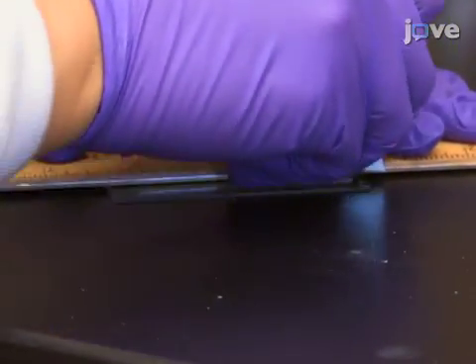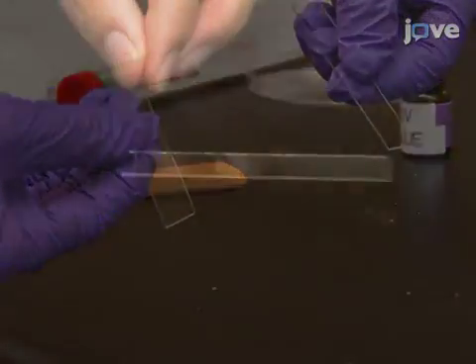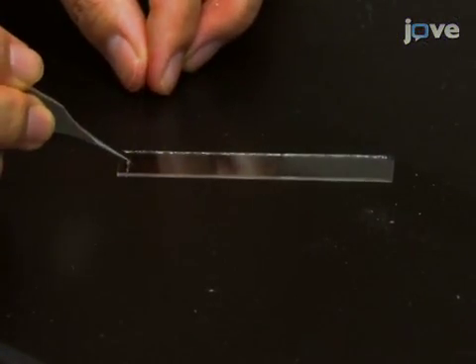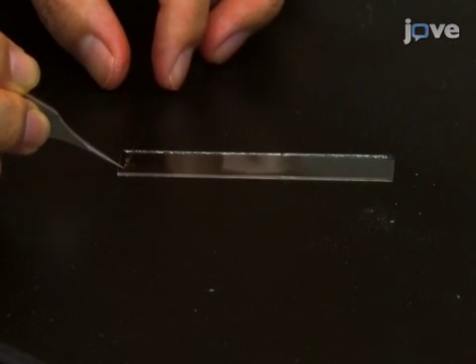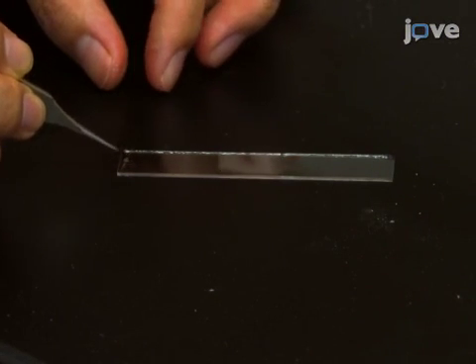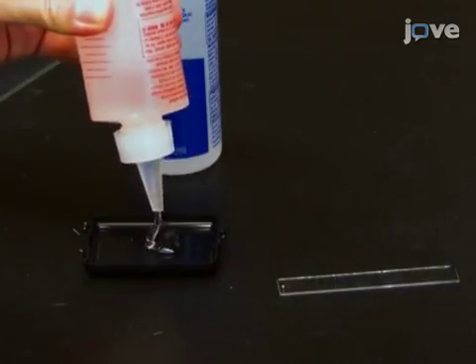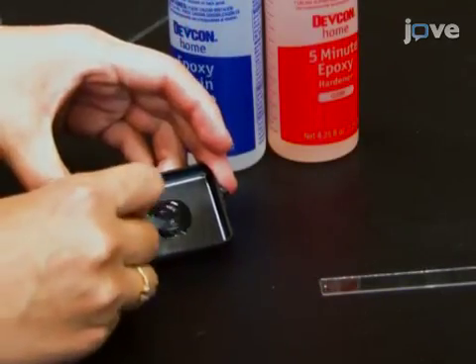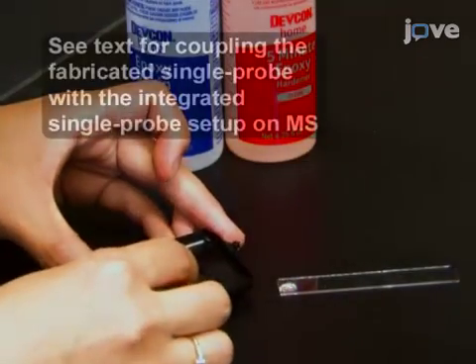Next, cut a standard microscope glass slide in half lengthways. Then place a single probe onto one end of the glass slide so that the nano-ESI emitter is pointed outwards. Apply regular epoxy to the body of the single probe so that it becomes secured onto the glass slide before leaving overnight for hardening.